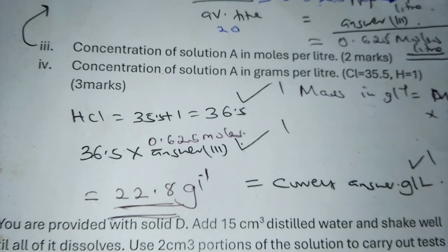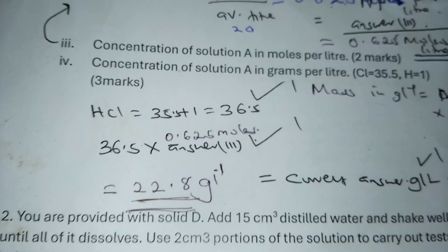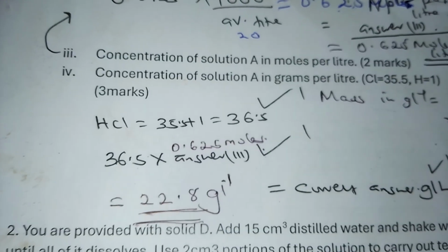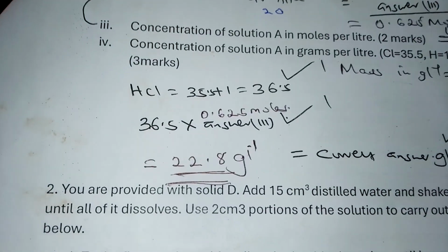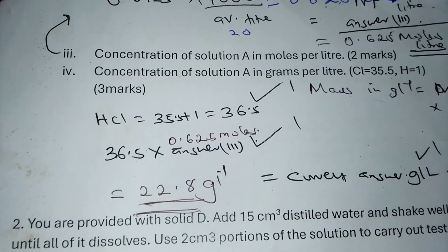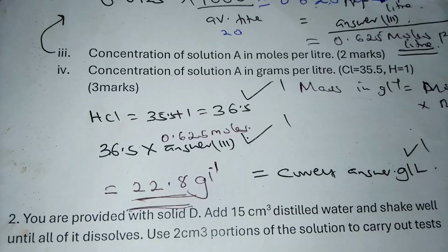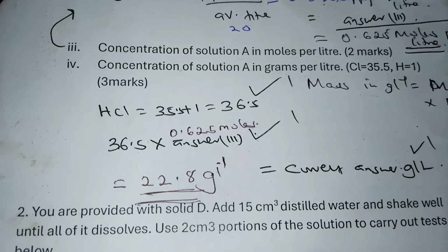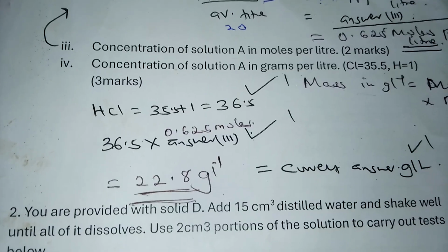And solution A, remember, was hydrochloric acid. Then we were supposed to answer Roman 4 of that C. We were told to calculate the concentration of solution A in grams per liter, and we were given the relative atomic mass of chlorine, 35.5, and hydrogen, which was 1.